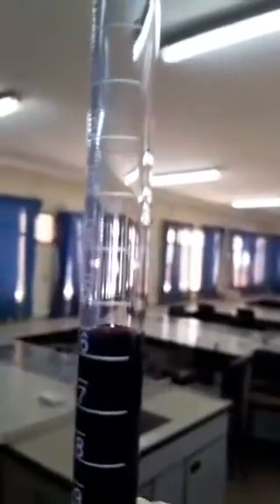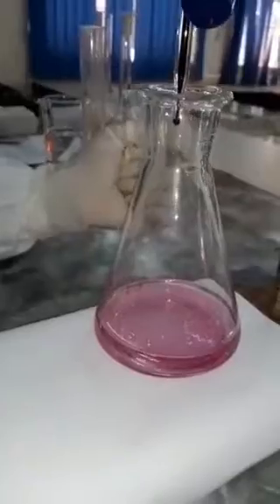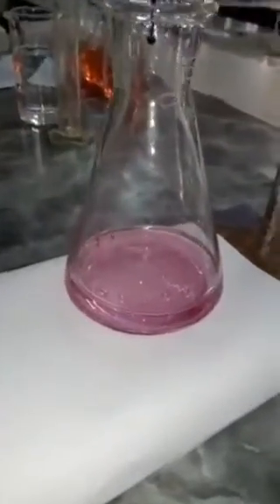And the reading is 5.7 on the burette. So that's the one we're going to record. That's our first reading. We're going to record that, 5.7. You should repeat this as many times as possible, but we'll repeat it for at least 3 times. So this is the second one.